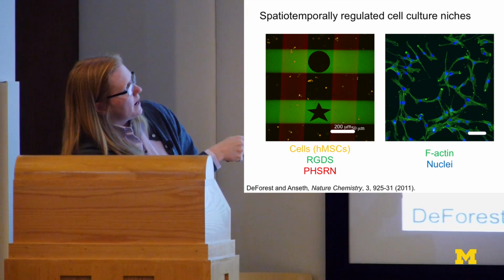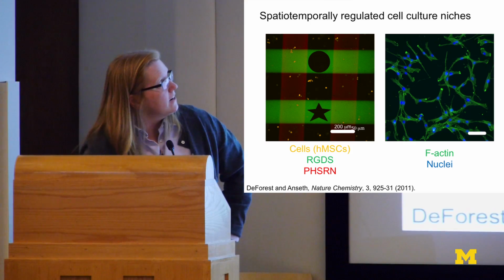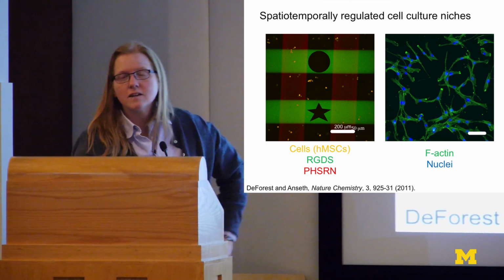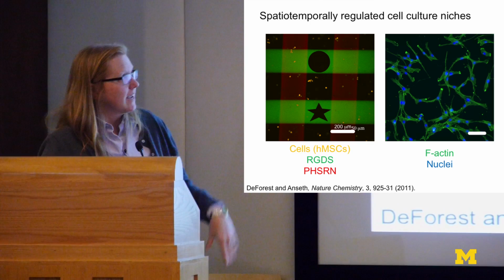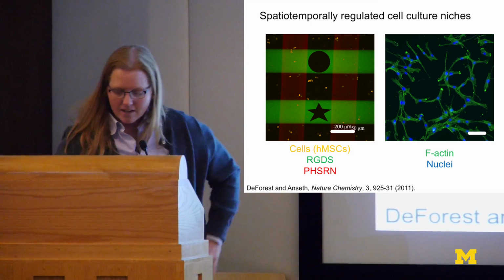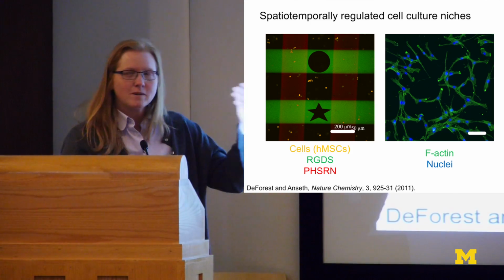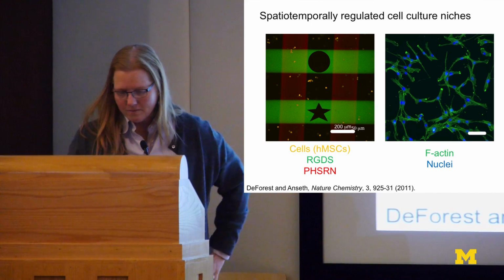And then I can either degrade this region and remove that signal, or I could even degrade and capture those cells, much like I wanted to capture that cancer cell. And then perhaps at a later time, remove these. And it's all cytocompatible, so I can capture these cells, culture them, expand them, do further experiments on the system.